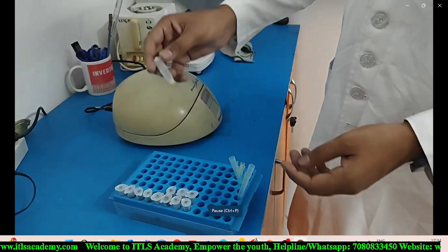Okay, what we are going to do, we need to centrifuge it for 10 minutes at 3000 RPM, as you can see. Now place all the Eppendorf carefully and make sure that you balance it properly.